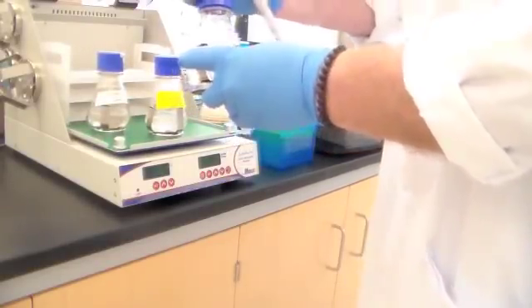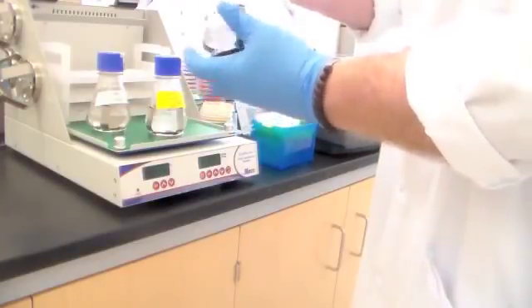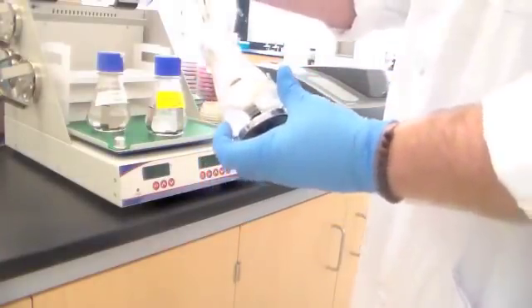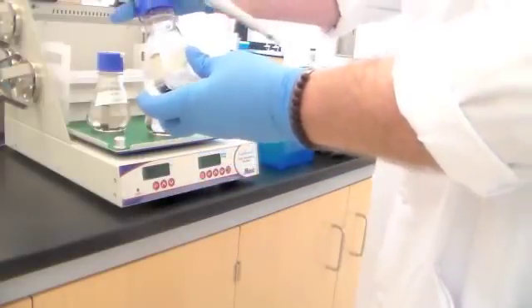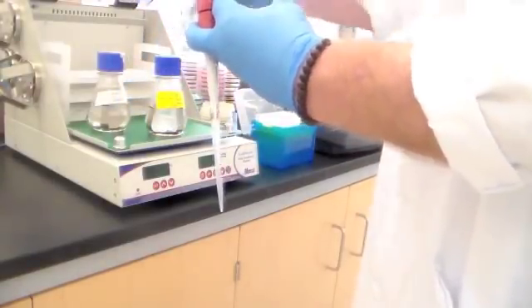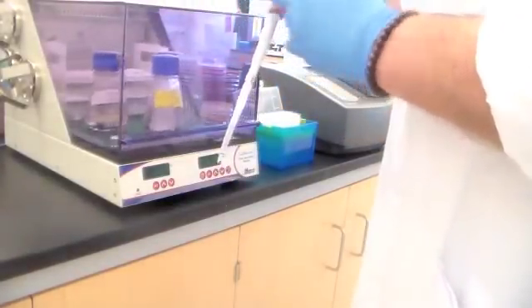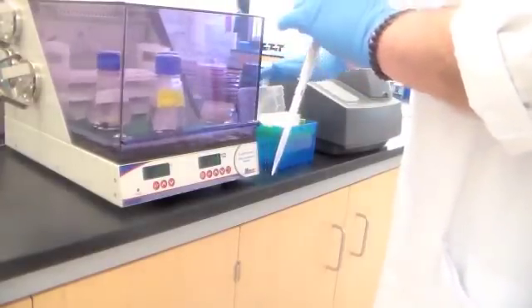I just inoculated this media a few minutes ago, so I'm going to take the time zero time point. I'm taking a 500 microliter, or 1/2 of 1 mil, aliquot. These are in magnetic clamps, so you can just set it back into there, close the cover, and it will begin to grow.